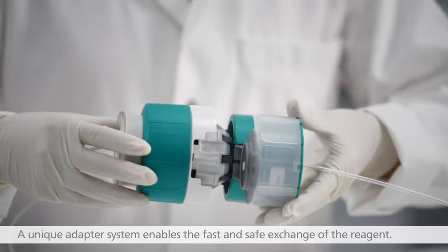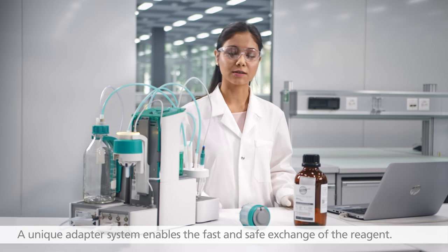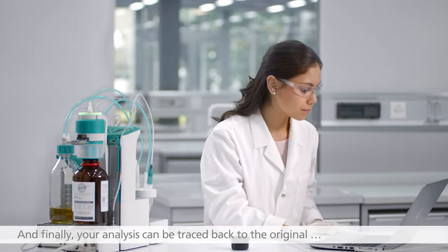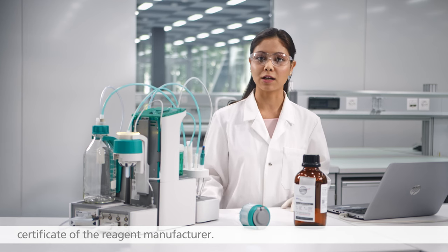A unique adapter system enables the fast and safe exchange of the reagent. You no longer have to enter reagent data manually on your computer. And finally, your analyses can be traced back to the original certificate of the reagent manufacturer.